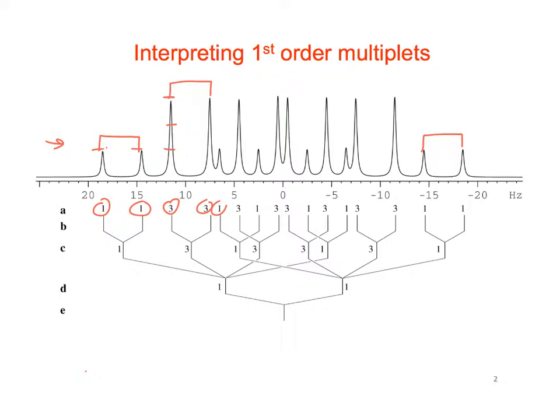And so that kind of helps sometimes. So in here there's a small doublet. There's one here. Here. Here. And here. So, at 0, I thought there was a doublet. That's not a doublet. Right at 0, no, that's not actually a doublet there.